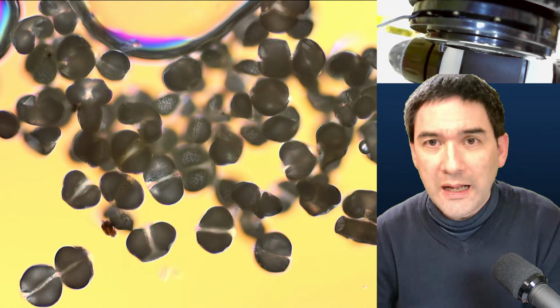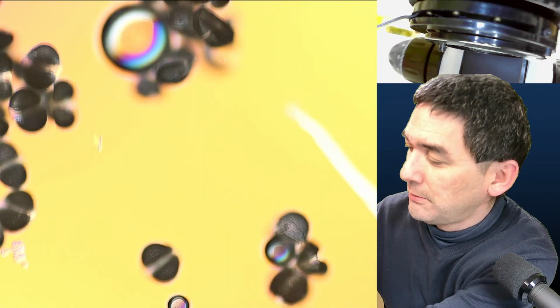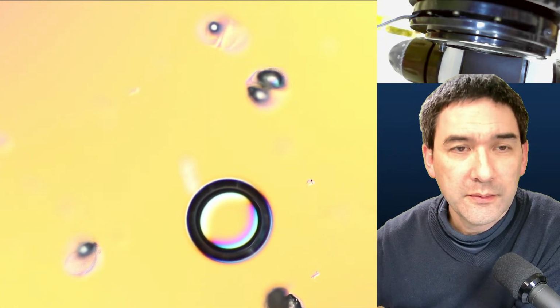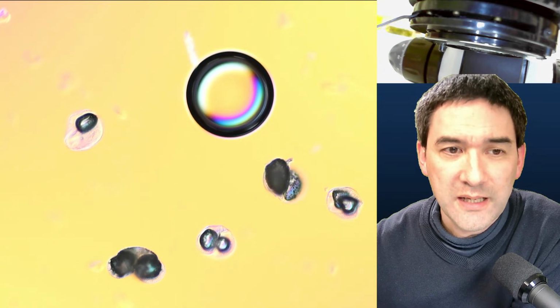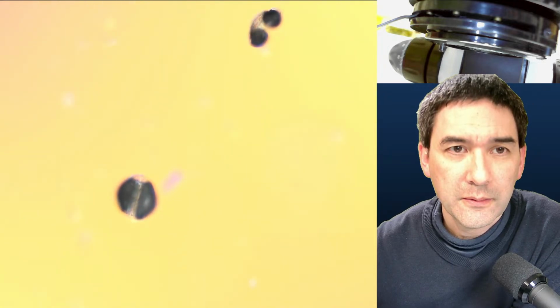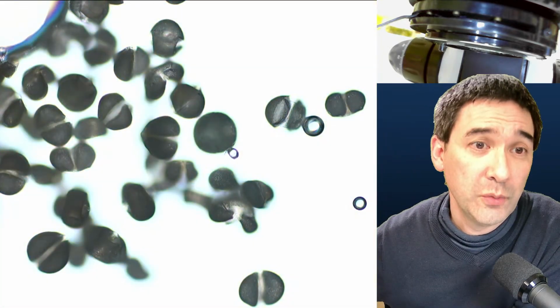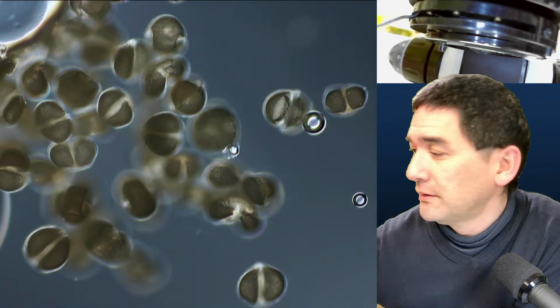And I'm just going to add now the second slide here, which is Euparal, a resin-based mounting medium, only to be used if you have fresh air. Okay. And this is how it looks here. And you see, same pollen, same sample, but look how different. It's an air bubble, by the way. Okay, again, let me just change it to a different color if you want to. So maybe like this a little bit. And over here.